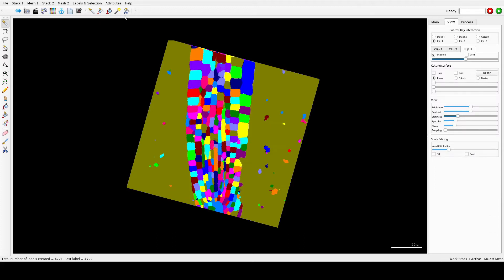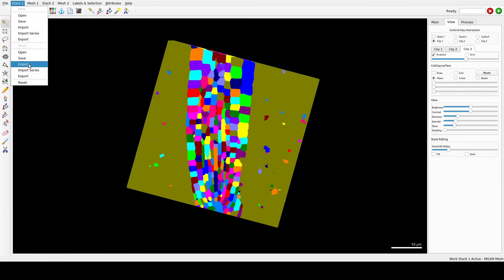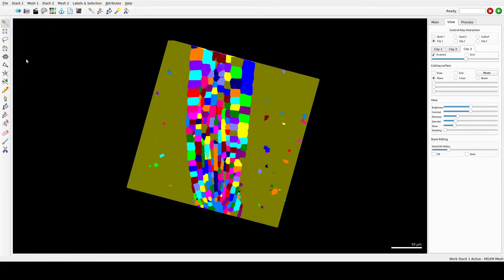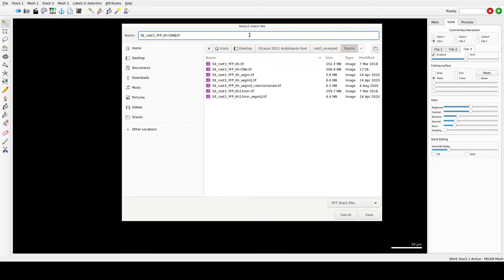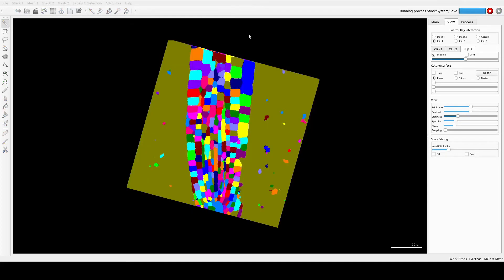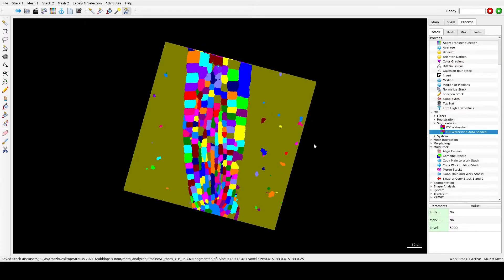Save the segmented volume in the Work Store under the Stack menu, as there is no undo function here. The segmentation fills the entire volume with labels and the sample will be buried inside, so you need to remove the outside label by running Delete Labeling Volume — press Alt and left-click.